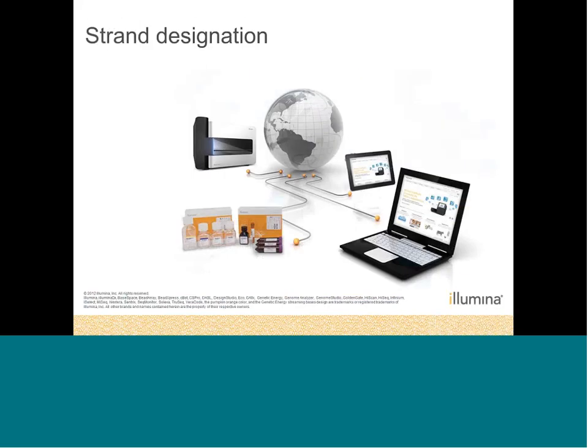Now that we know what a manifest is used for by GenomeStudio, let's take a look at some of the manifests. Before that, in particular for genotyping, we need to understand strand designation. This is because a SNP is a double-stranded phenomenon, and so you need to look at SNPs as double-stranded phenomena. When a SNP is reported in a database, it usually only refers to one strand or the other. And so we have to identify which strand the SNP is being reported on.